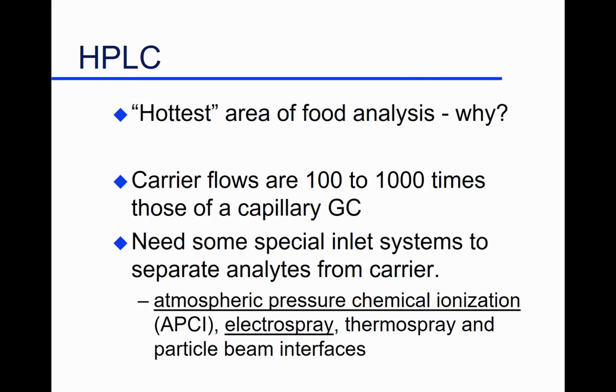HPLC probably is one of the hottest areas of food analysis. And if I were to say why, I'd have to be kind. I sometimes do tease people that like LCs. I would say it's because they're so far behind gas chromatography, but that might offend. Are you still here? Yeah. Can't help myself.